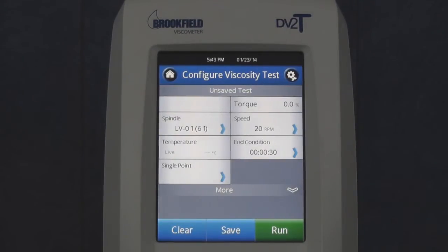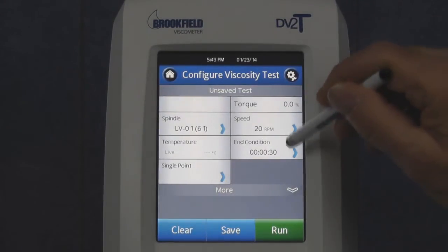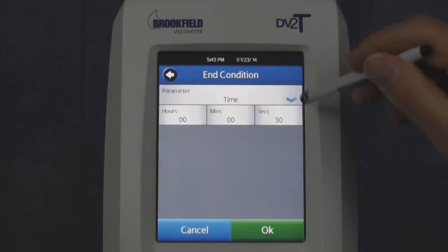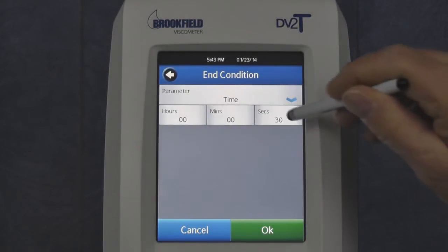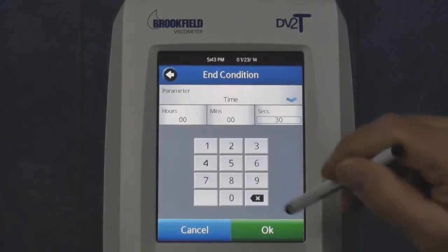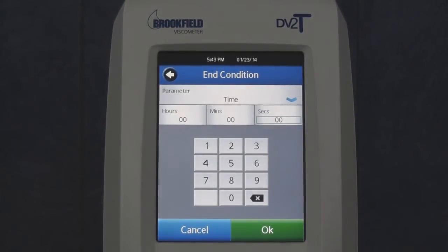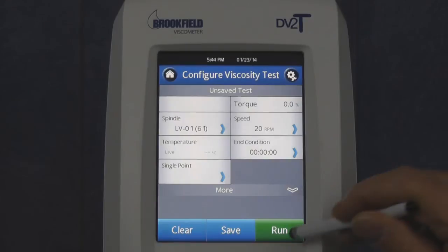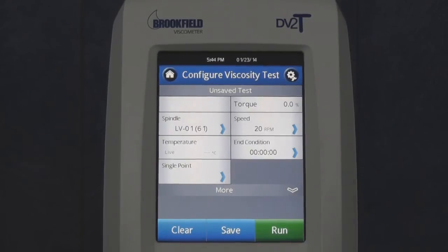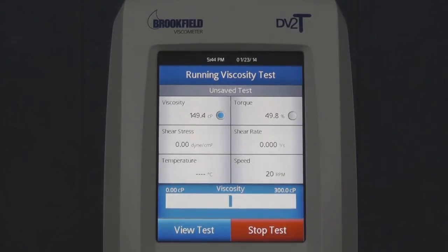If an end condition of time is selected and a time of zero hours, minutes, and seconds is entered, the test will end when the operator touches the Stop Test button in the running viscosity test screen.